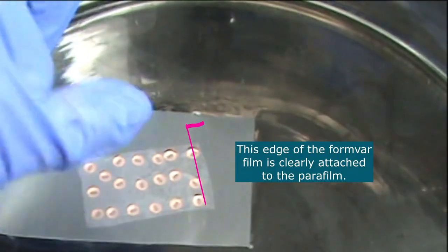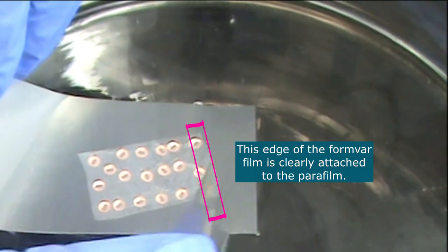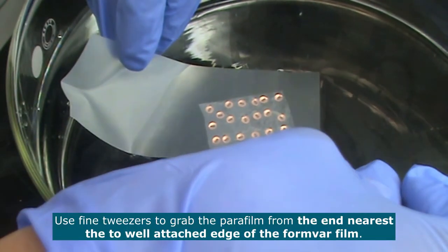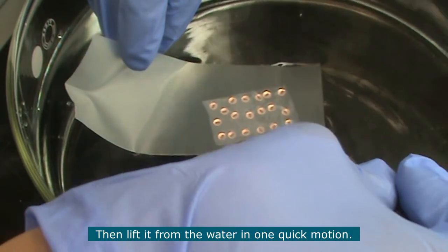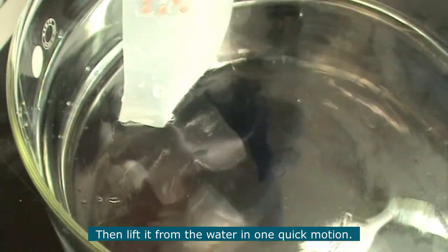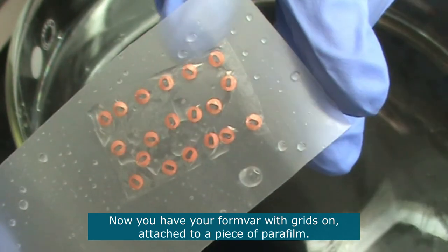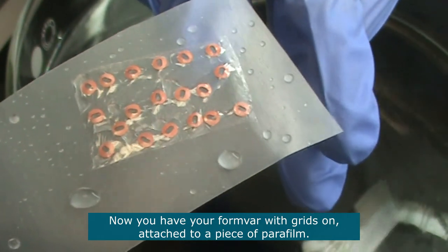See which edge looks clearly attached to the parafilm. Pick the parafilm up from that edge and then in one quick motion lift it away from the water. Now you have your formvar with grids on the parafilm.